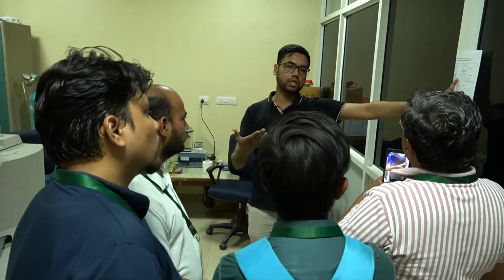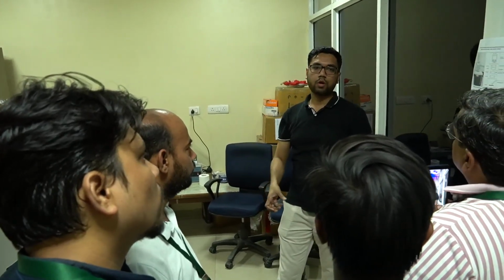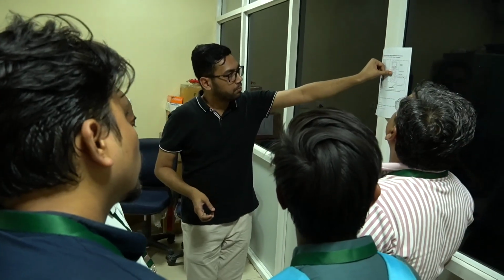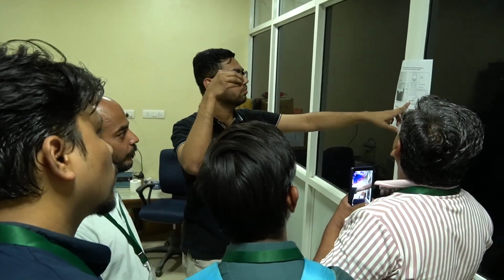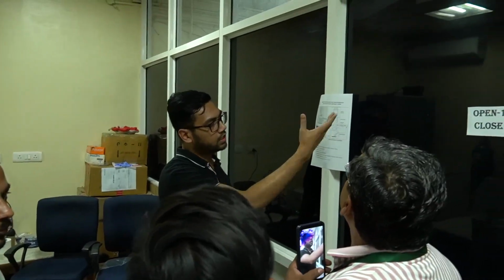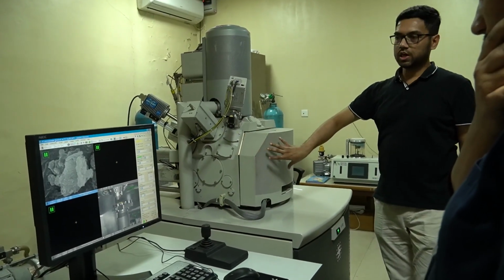We are using an electromagnetic lens because the electron is a charged particle, so we have to confine it into a fine probe or beam. Based on the electromagnetic effect of these lenses, we confine those electrons, and after passing this section, finally the electrons are injected onto the specimen, the sample, and electron-matter interaction takes place. We get secondary electrons, backscattered electrons, like secondary signals, and we capture those signals and analyze them on our computer.